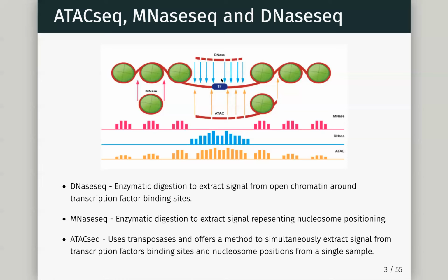So yeah, if it was much bigger than 147, we would start to at least know that we're contaminating our open chromatin, nucleosome free, sorry, with fragments which could have come from nucleosome. The issue is that there could easily be fragments in here which are over 147. We're just making that assumption that they're probably belonging to it. It's not an exact science here. It's not exact, but it does a pretty good approximation.